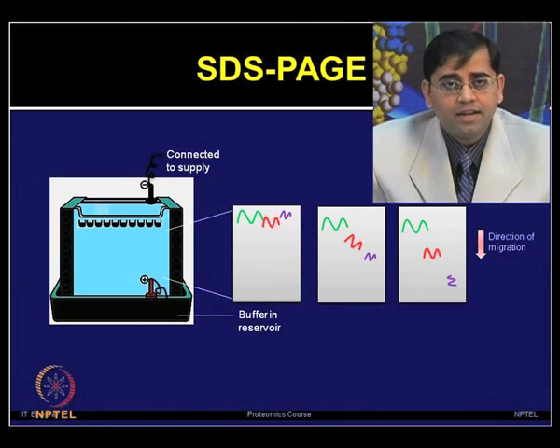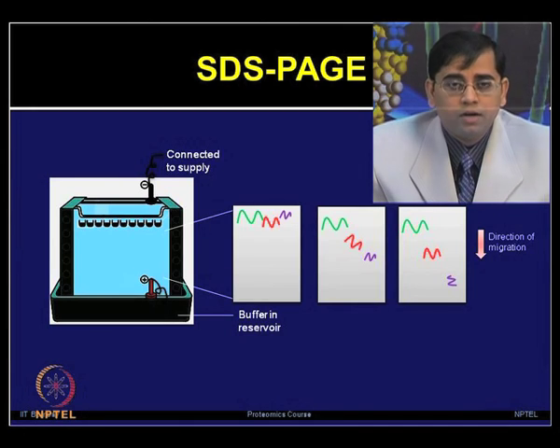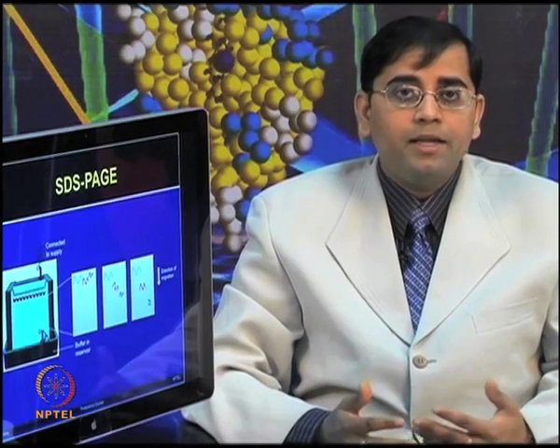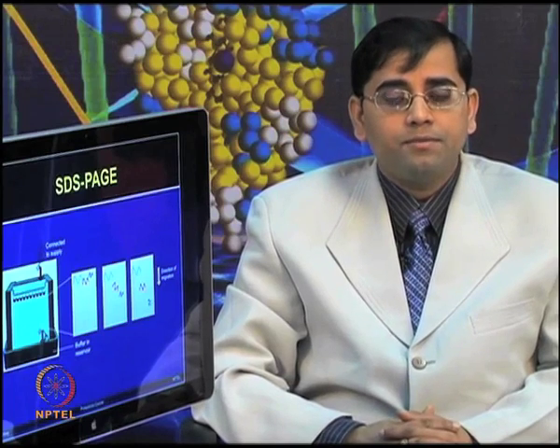You can add the standards or known molecular weight proteins to determine your unknown proteins. I think it is important to clarify that in 2DE, when you use SDS-PAGE, you do not need to make these wells by adding a comb, because you already have a flat IPG strip which has done the first dimension protein separation.